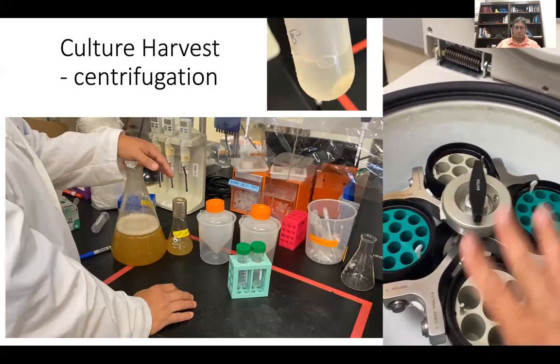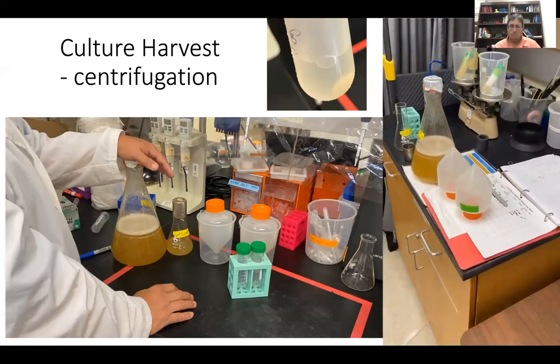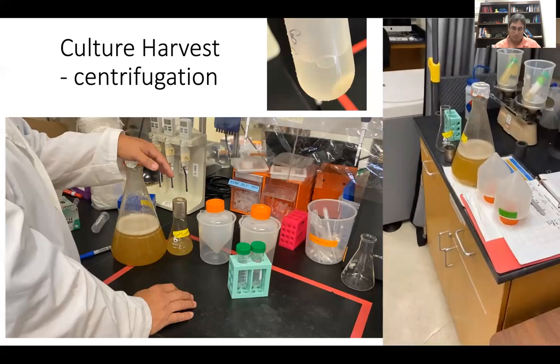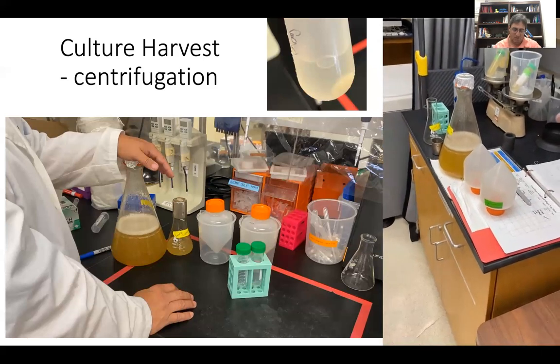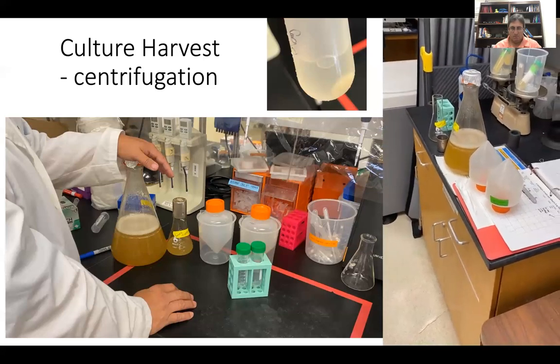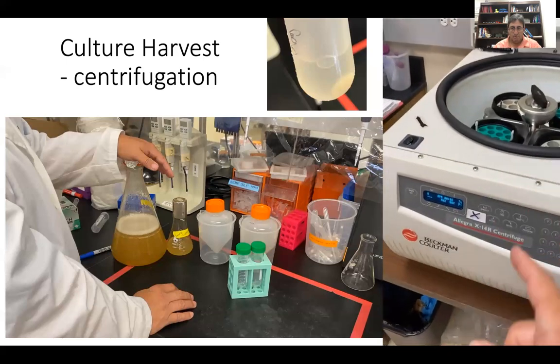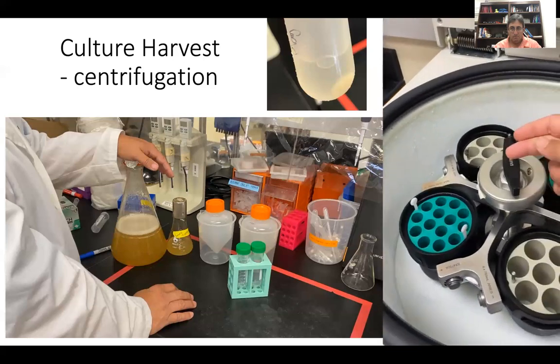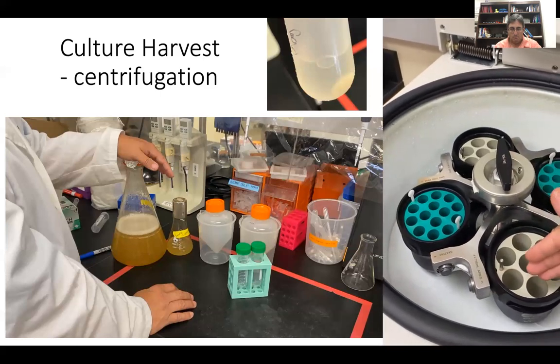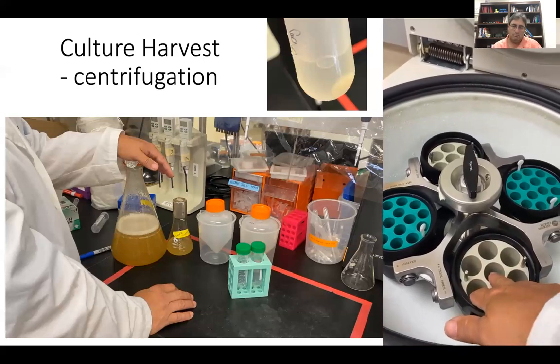For centrifuging bacteria like this, 3,500 RPMs, or correction, 3,500, stop. So when centrifuging bacteria cells like this, the centrifugation force or relative G force of about 3,000 to 4,000 is all you need. 3,500 times G is about right. You do not need this. You do not set this at 3,500 RPMs. The distance from the center to the actual tube for each rotor can translate out to different G forces. So RPM does not equal G force. Make sure you undergo centrifuge training before you do this.